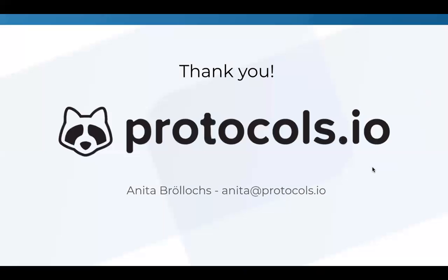So we do take this seriously. We know that a lot of people rely on the method and need 100% access to it. So we encourage people to make those backups and do that exporting as well. And we try to make it as easy as possible.